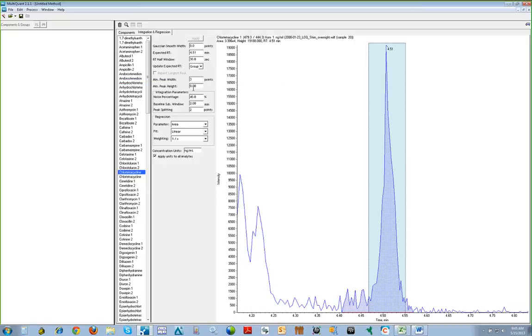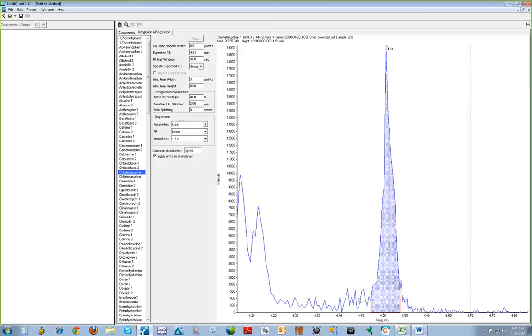For example, if we want to change the peak splitting factor, here we will change it from 2 to 0, then click Apply, and the integration will update automatically.